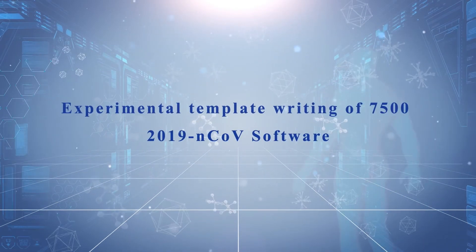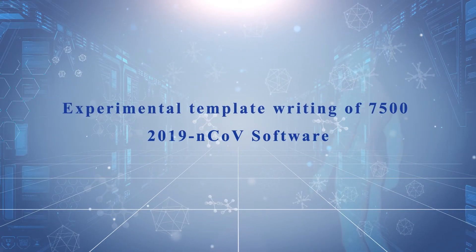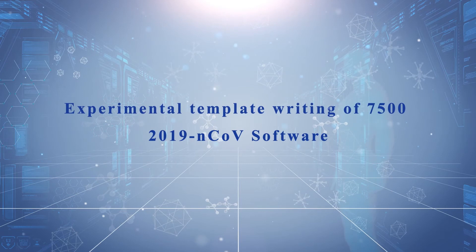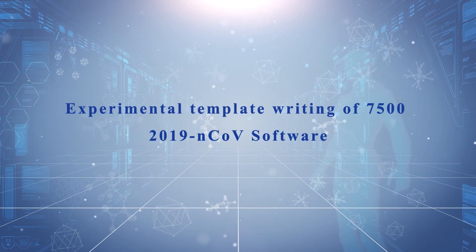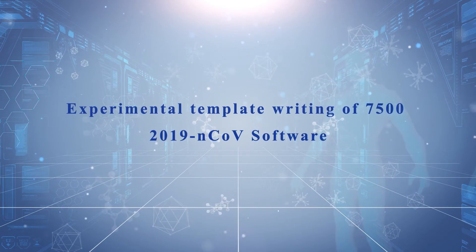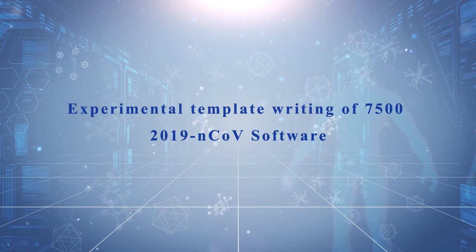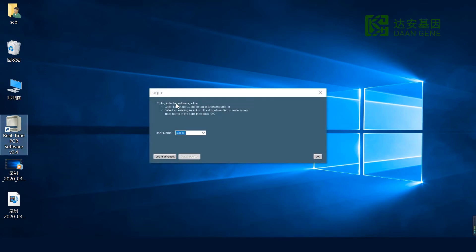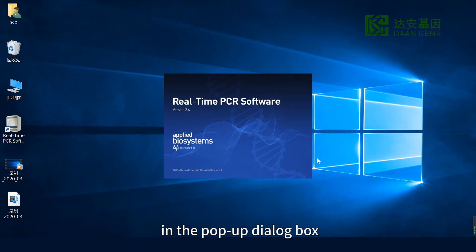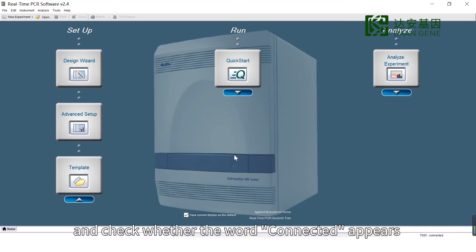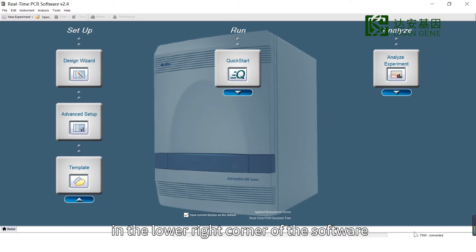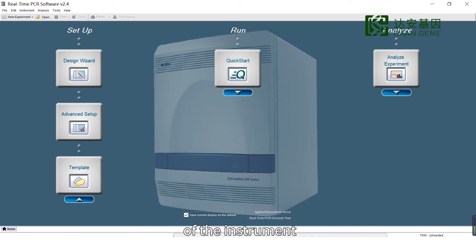Experimental Template Writing of 7500 2019 Novel Coronavirus Software. Double-click the software and click OK in the pop-up dialog box. Open the software and check whether the word 'Connected' appears in the lower right corner to confirm the normal connection of the instrument.